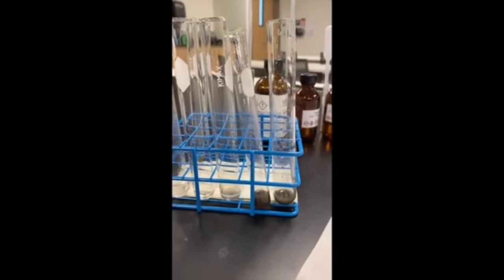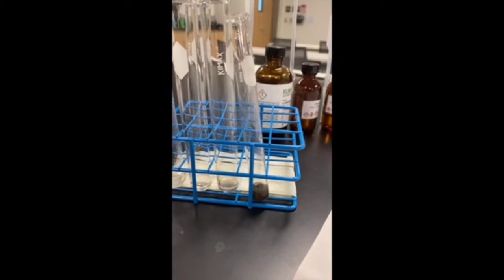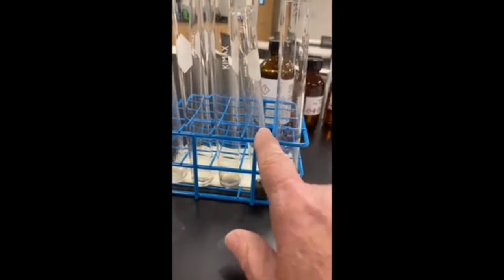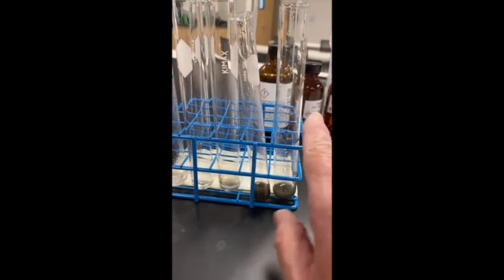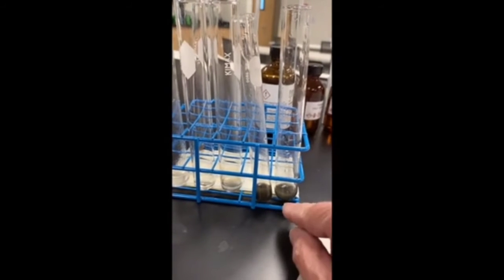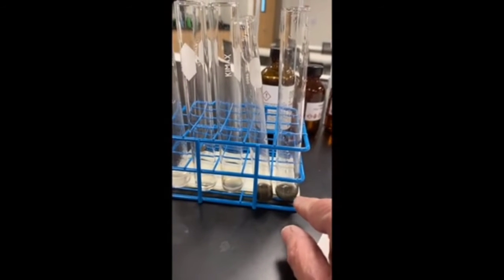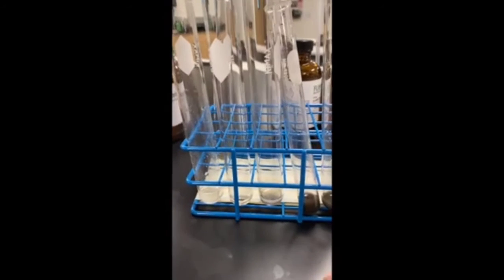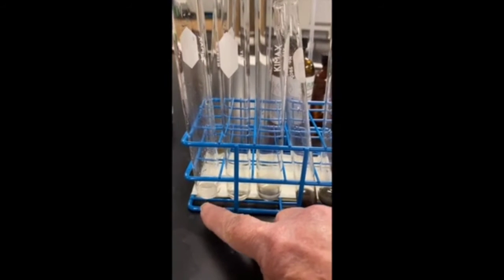All right, it's been about 10 minutes. I know it's kind of hard to see, but there's actually a bit of a silverness to the last 2 here. So the formalin and acetaldehyde did get a silver mirror. I know we have the gray in there, so it's a little hard to tell, but I'm letting you know it did have it.